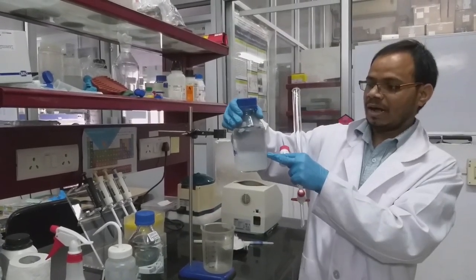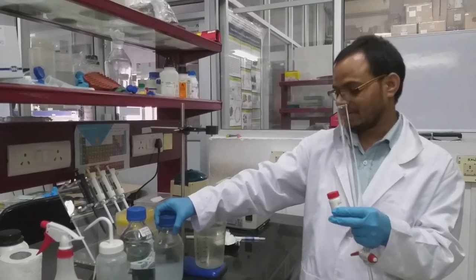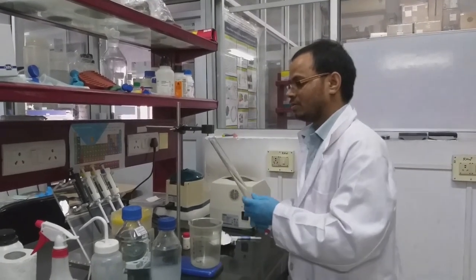So this is already overnight swollen beads, so we can use it directly. We need not wait for another 24 hours. So I am going to keep this one.